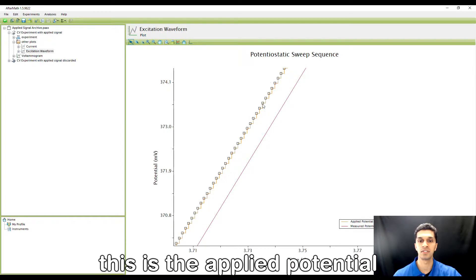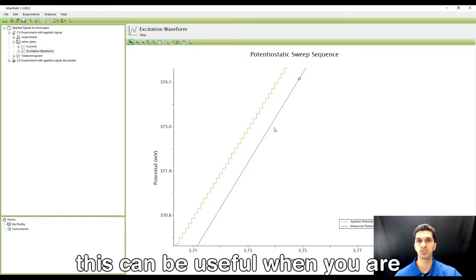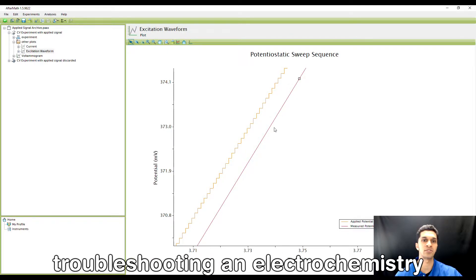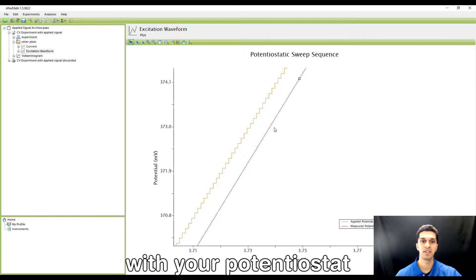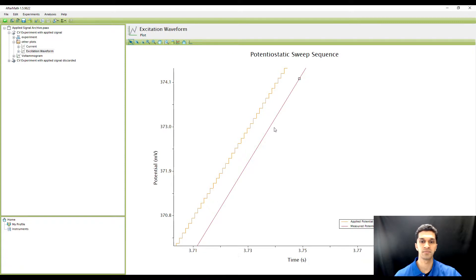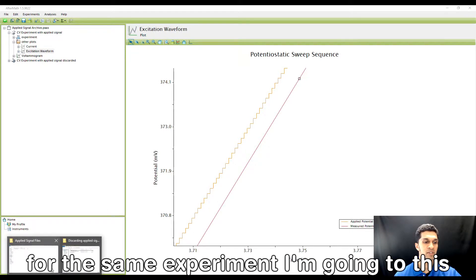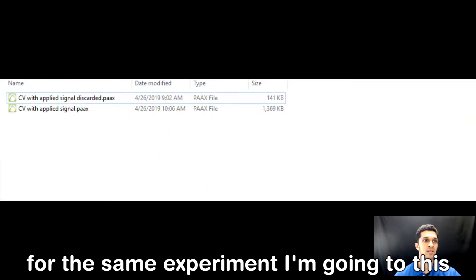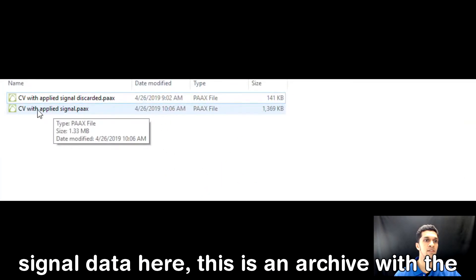But upon closer inspection as I zoom in, you will actually see that there are two lines. This is the applied potential and this is the measured potential. This can be useful when you're troubleshooting an electrochemistry experiment or some kind of problem with your potentiostat, but it can also lead to very large data files.